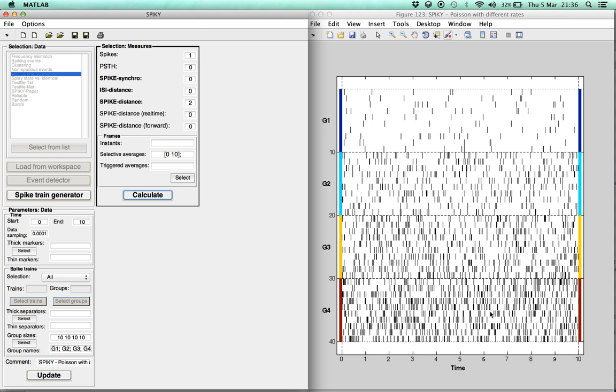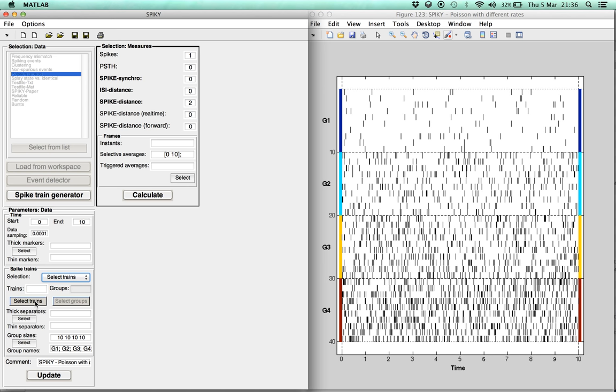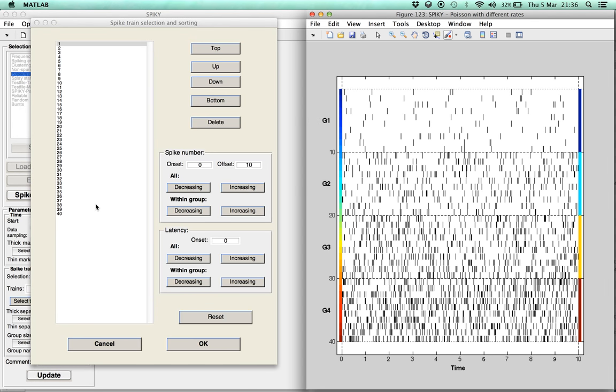In order to sort the spike trains, we switch the spike train selection from All to Select Trains, and then press the Select Trains button. This opens the spike train selection and sorting window.